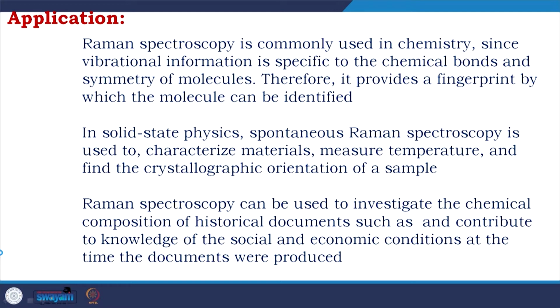So, in this way you could recover old data and learn about the origin and authenticity of the document. There is a huge initiative where people try to commit fraud with historical documents, claiming that they have found papers which are from ancient times. Raman spectroscopy is instrumental in detecting the fraud.